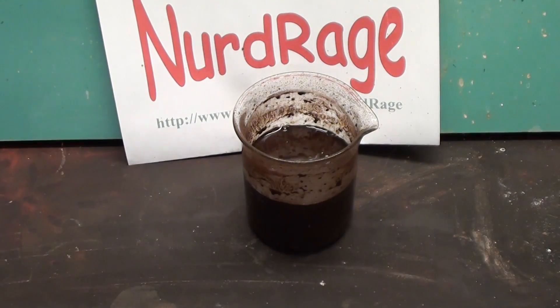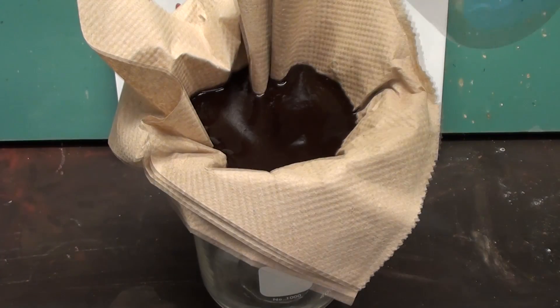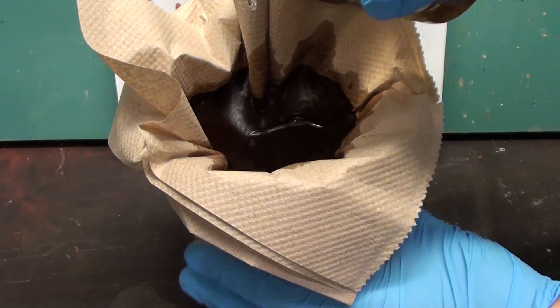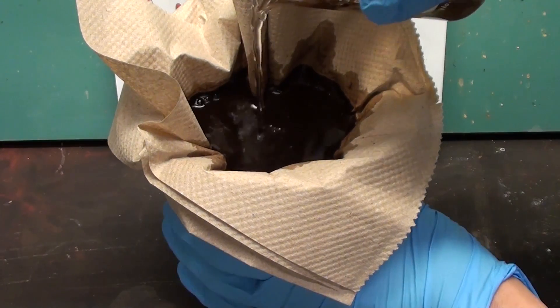Leave the mixture to stand until the bubbling stops — this should take about an hour. Now filter the mixture and wash the original container as well as the manganese dioxide with water to get maximum transfer and to clean the product from any remaining sulfates.